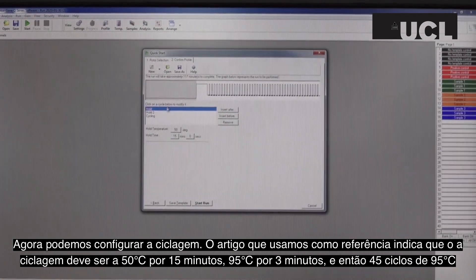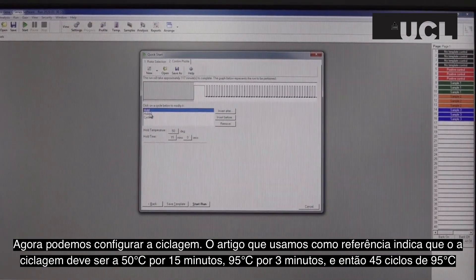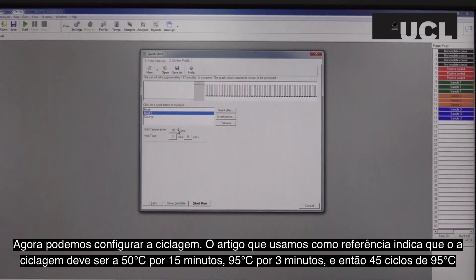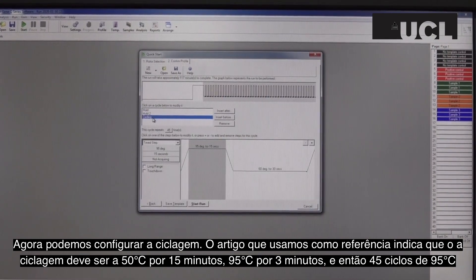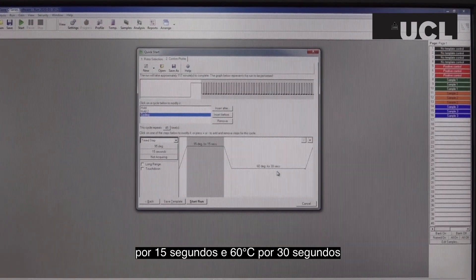We can then set up the cycle settings. The paper we have referred to states that the cycle should be held at 50 degrees for 15 minutes, 95 degrees for 3 minutes, and then 45 cycles of 95 degrees for 15 seconds, and 60 degrees for 30 seconds.